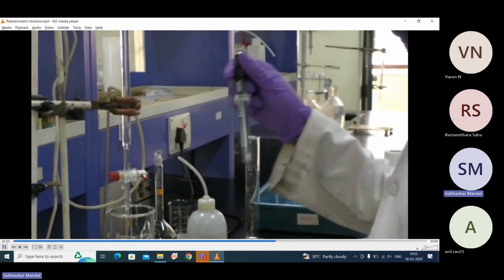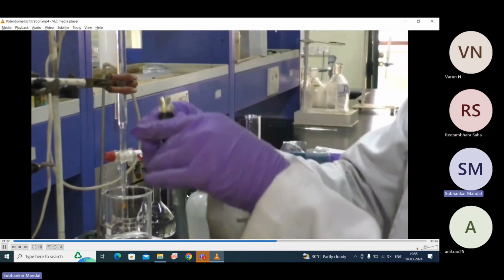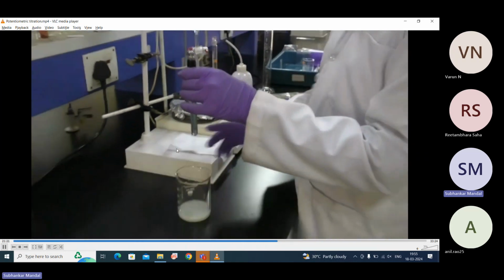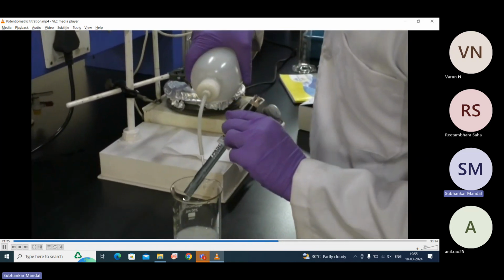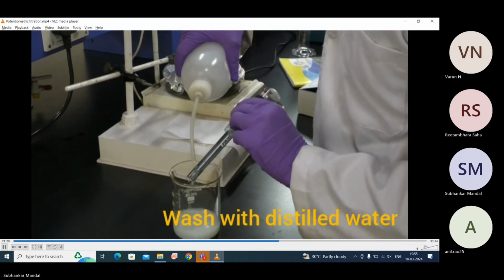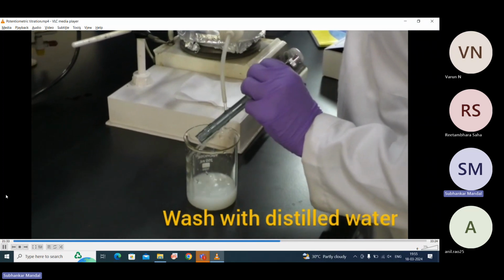Okay, so this is the thing. In this part you have the glass electrode.